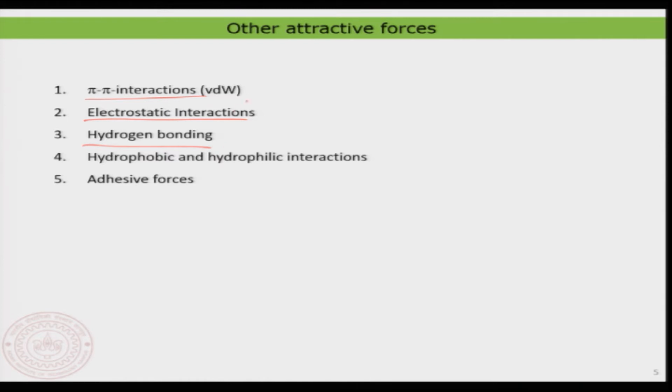These are forces that you would say act between two molecules, at the molecular level. But when there are more molecules interacting together or repelling each other and so on, then you would call it something like hydrophobic and hydrophilic interaction.